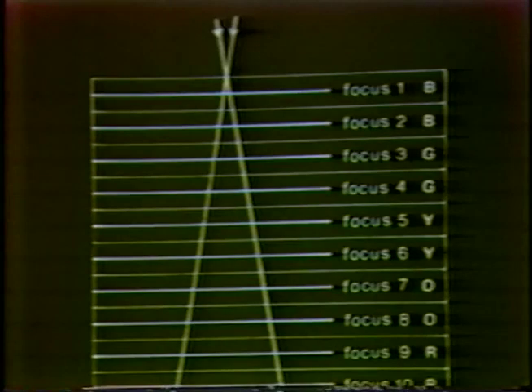Now, if you do this trick with a tandem scanning microscope, you've now recorded in full color, in reflection or fluorescence or any combination, a high-resolution stereoscopic pair. I haven't got stereo projection facilities here, but I'll show you some examples. This is a mechanical device with which we first made such stereos, cobbled together out of sawn-up old light microscopes. You can see two fine focus mechanisms bolted together at an angle. We now simulate that with computer-controlled motors. We can change the color of the illuminating light as we change the focus.